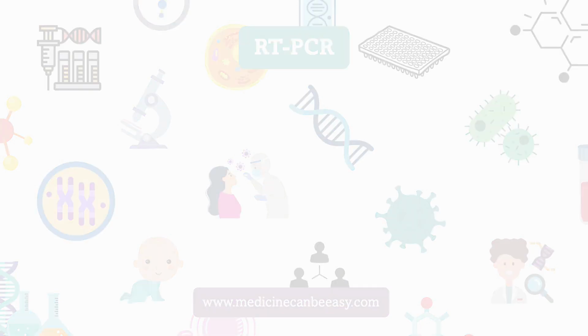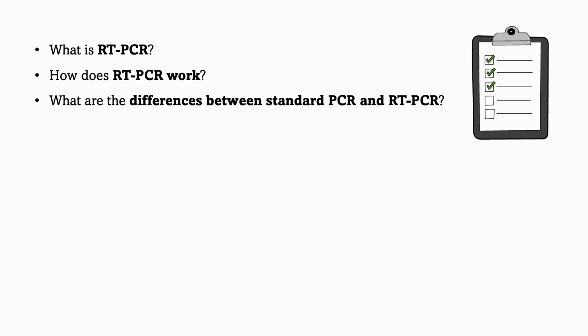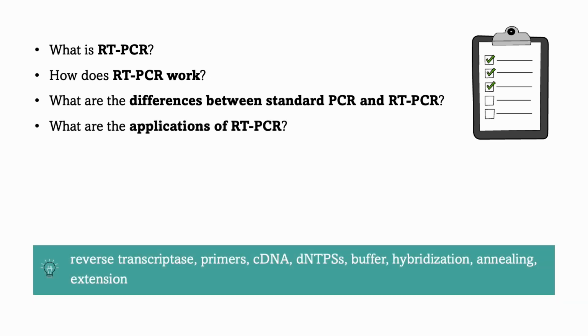So what are you going to learn in this video? I am going to explain what RT-PCR is and how it works. We are also going to compare standard PCR and RT-PCR and discuss the applications of the method. Okay, so let's start.